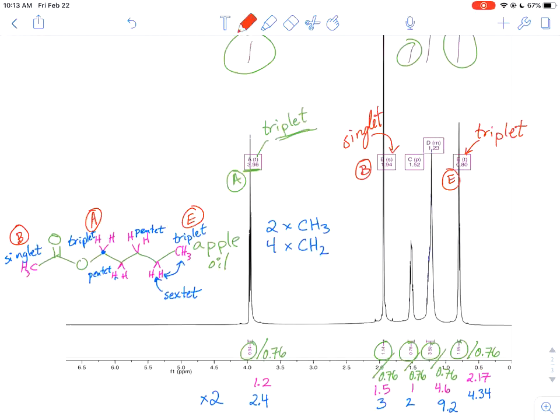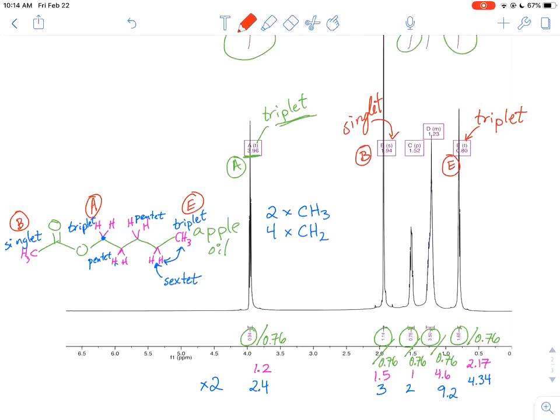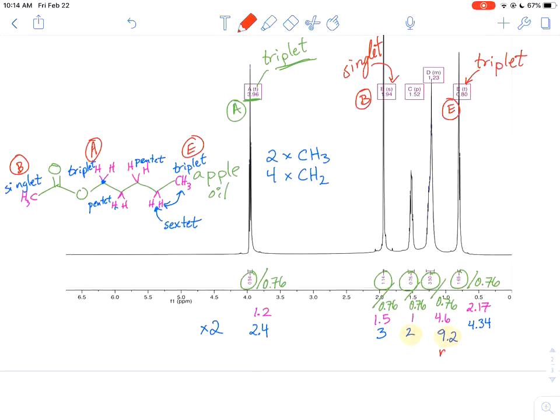So we have only two signals left, but we have six hydrogens or sorry, two peaks left. But we have three sets of protons left to assign. And this here is really what I wanted to get to in this video, at least show you that that's okay. That's not a mistake. So let me clean that up real quick. And just point out how the integration could be useful here. We have two signals left to assign. One that's assigned to two hydrogens and one that's assigned to nine. And remember, the way that this was integrated was not great.